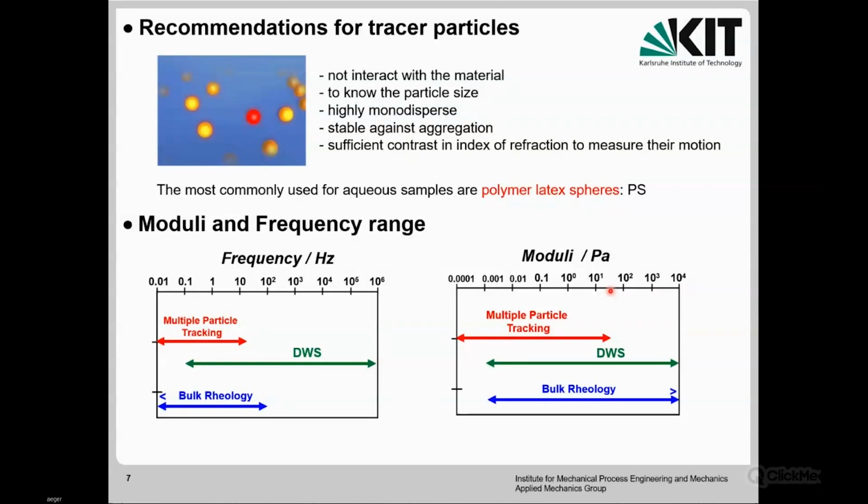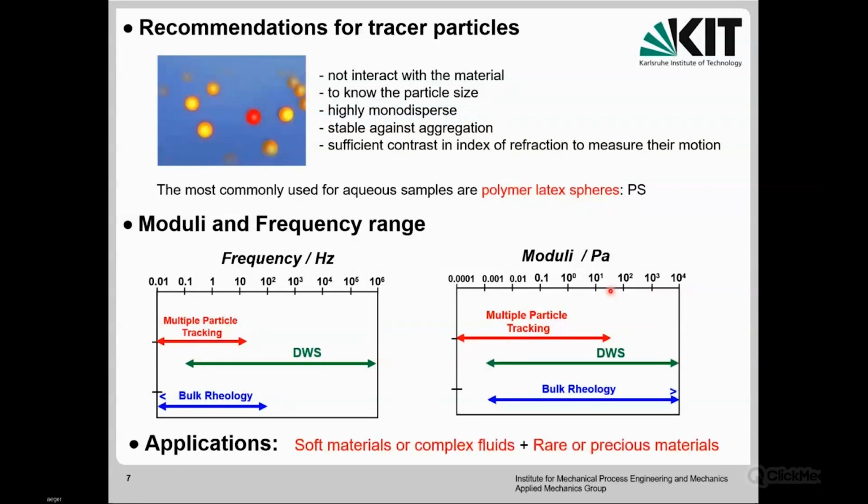As already said, in application, of course, you can study similar materials to what can be measured using conventional rheology, as a soft material or complex fluid. But what is interesting with DWS, or in general these microrheology techniques, is that you can investigate very rare or precious materials.